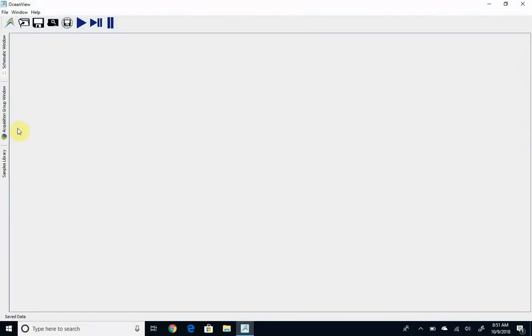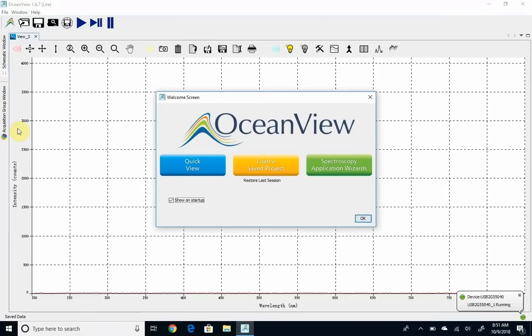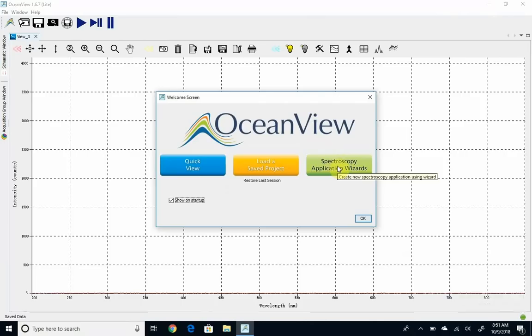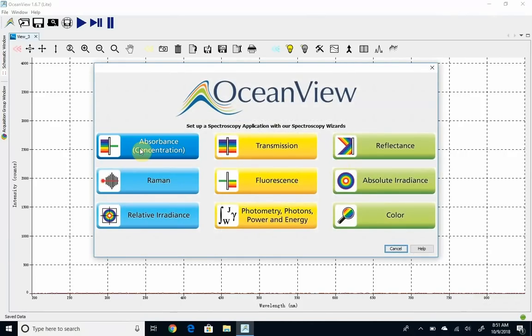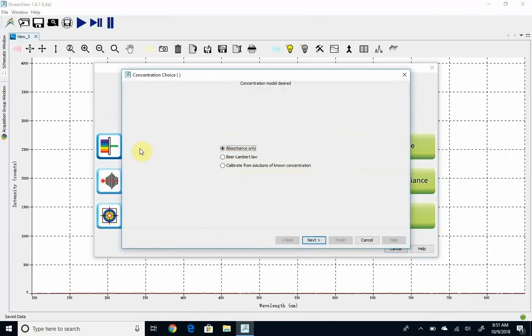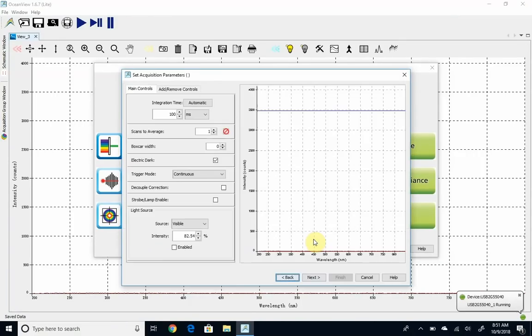When you open up the software, it will take a minute to initialize. You should get this welcome screen. You're going to click on the green Spectroscopy Application Wizards button, then on the absorbance button, and then in the bulleted list, make sure it's on absorbance only. That should be the default, then you're going to hit next.